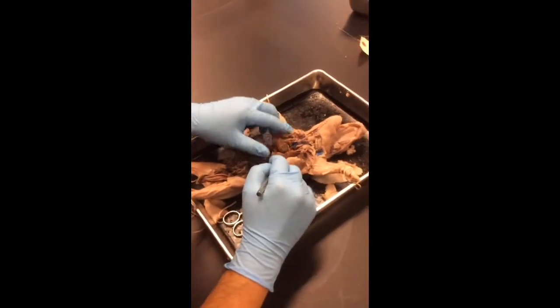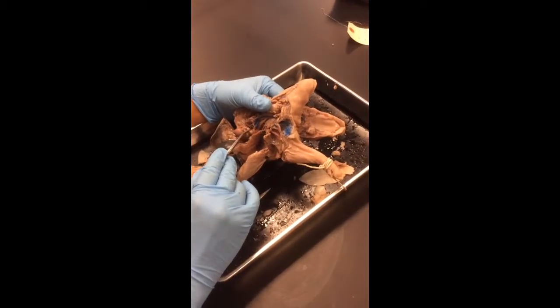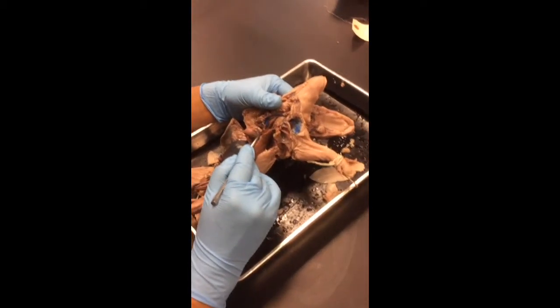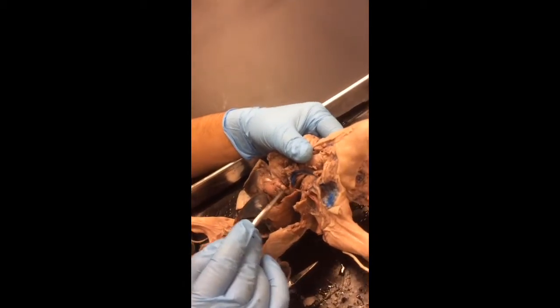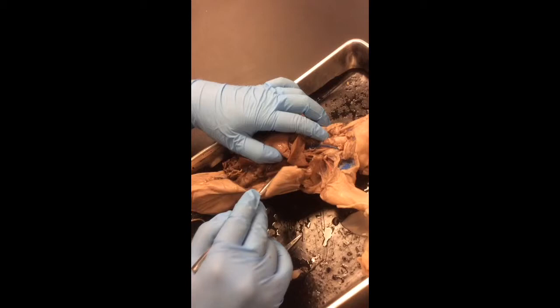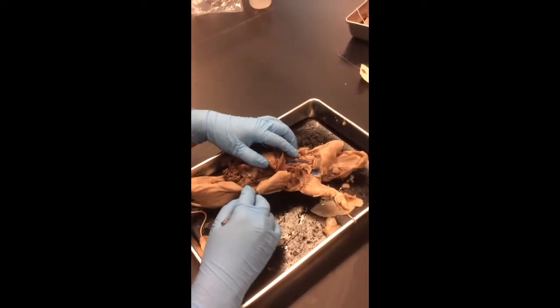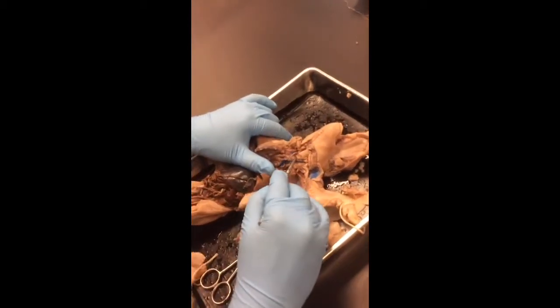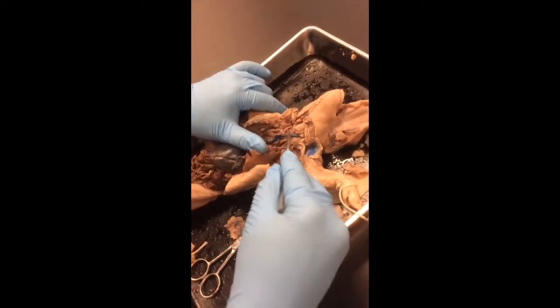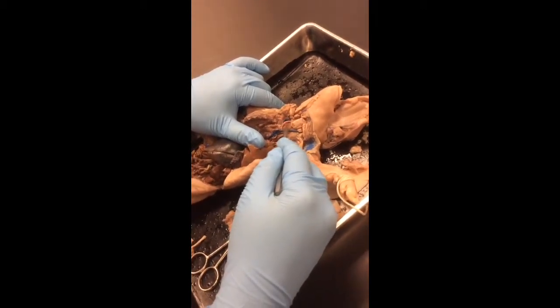Aorta is the big tube, right? So up here in the heart, the top one here is the pulmonary artery. Behind it, underneath it, is the aorta. So pulmonary artery on top, aorta below it, but the aorta is also the one on the back that I love to show from here. Brachiocephalic artery, don't worry about. Common carotid arteries are the arteries that go into the neck, into the head. So if you see it, common carotid. If it's red, carotid, blue, jugular, right?